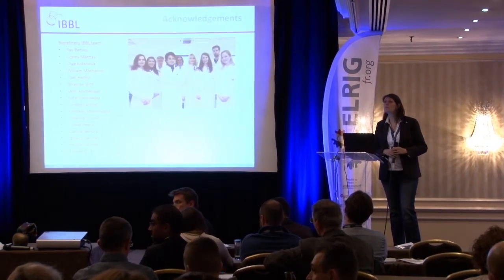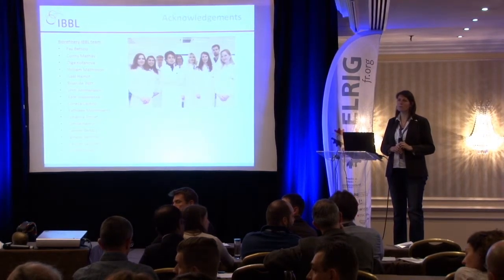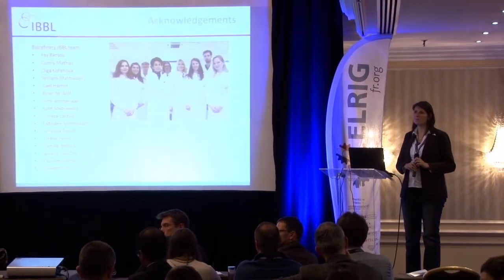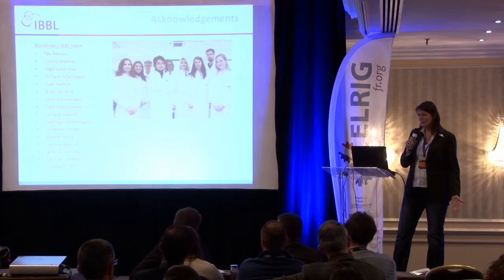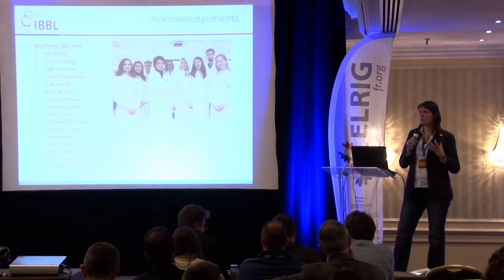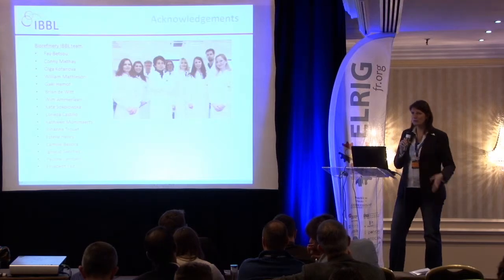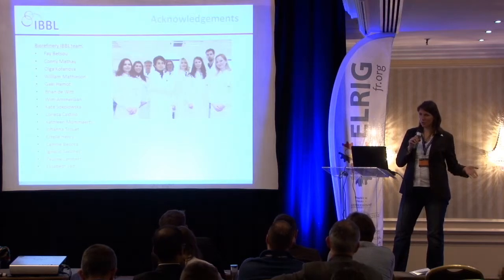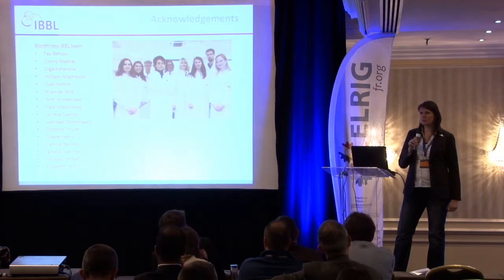When a customer requests a sample, is there a concern that you're taking a tube from a cold environment to hand it to the customers and then freeze it back? You're right. You will have a freeze-thaw cycle, but for DNA, this is not a big problem. Normally the customer says, I want to have 1 microgram, or I want that many microliters. And what we want is that we keep something in the stock for later purposes. But yes, you will have a freeze-thaw cycle, but for DNA, this is not critical.